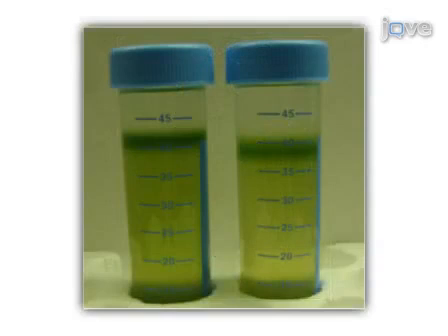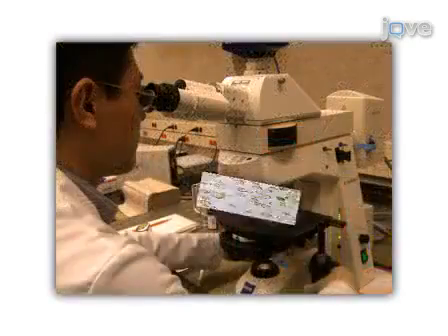The collected protoplasts are further purified on a sucrose density gradient by layering them with W5 solution. The protoplasts concentrate at the interface of the enzyme and W5 solution. They are then collected and washed before experimenting.